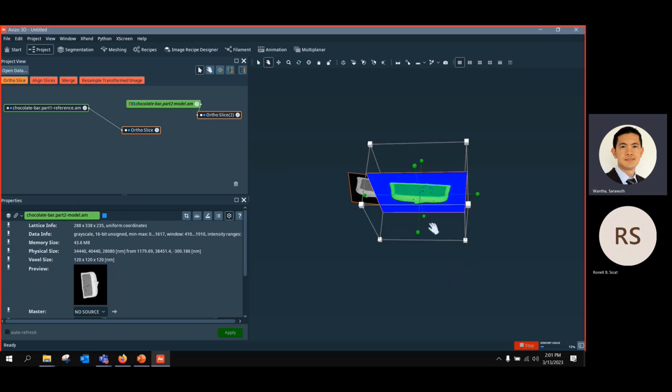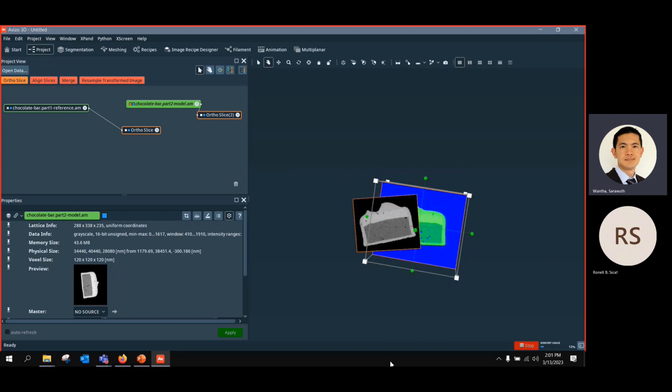Actually, it's possible because we did this project with a customer. So the idea is that they have this 3D volume of the mouse embryo, and they want to align the 2D histosections to a certain region. For example, they want to see where the stain on the histosection in 2D is located in the 3D volume of the mouse embryo. So you can align 2D onto the 3D surface. But 2D to 2D, we haven't really practically done it yet. You know what I mean? Like you have the 3D volume and you want to see where this 2D slide is located, at which level of the anatomical part of the embryo or the body.